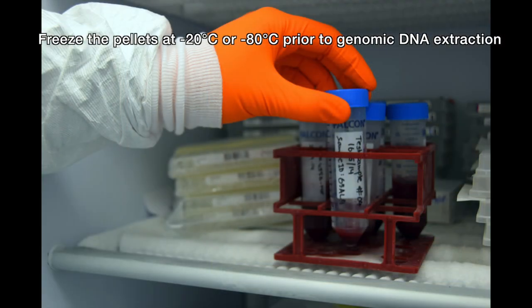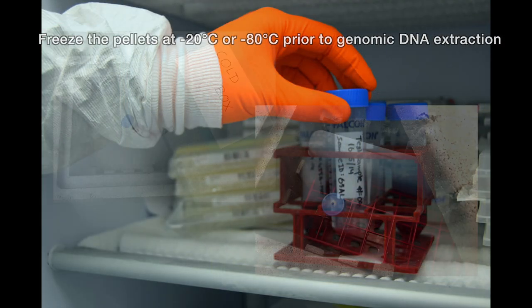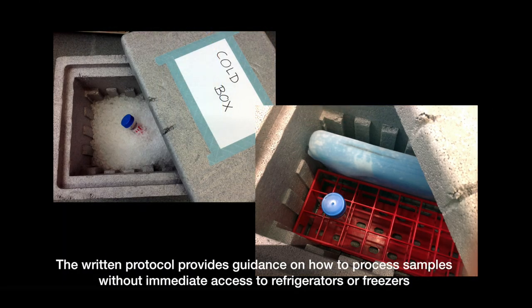For best results, store the samples frozen until extraction. Refer to the written protocol for details on how to process samples without immediate access to refrigerators or freezers.